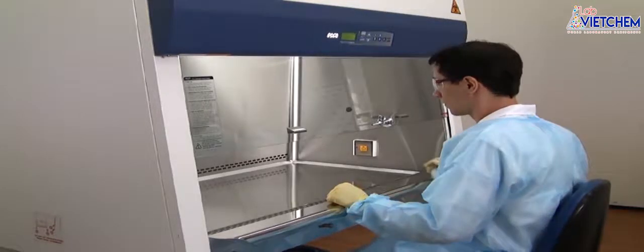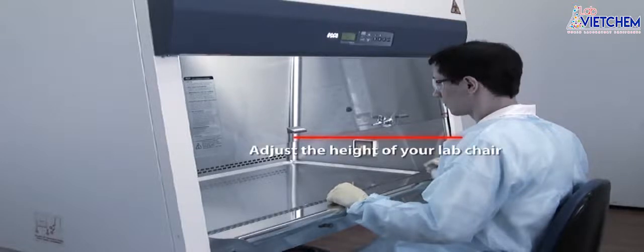Adjust the height of your lab chair so that your shoulders are approximately level with the front sliding sash. This will give you better visibility of the work zone and ensure that your face is protected by the front sash while giving you plenty of room to work.